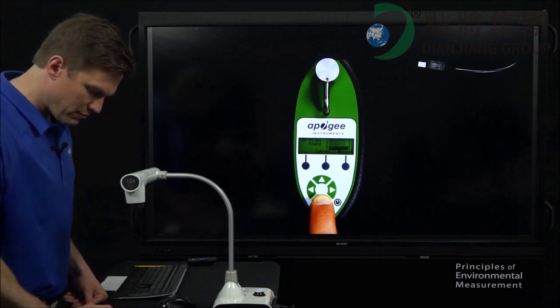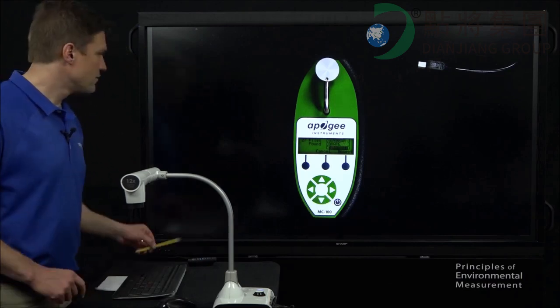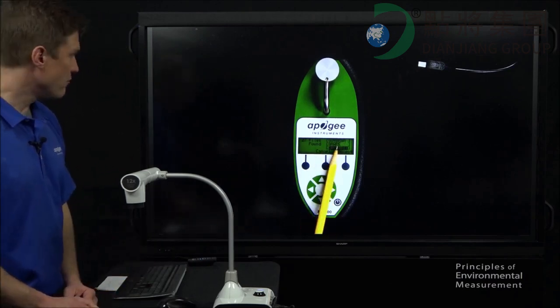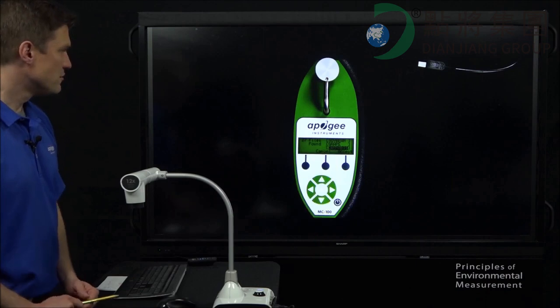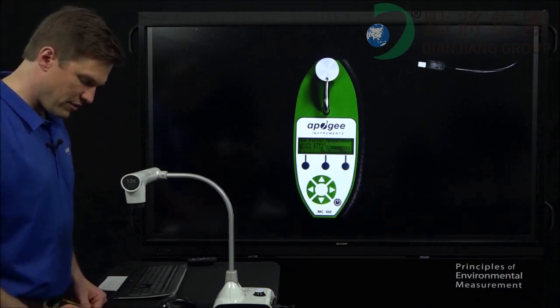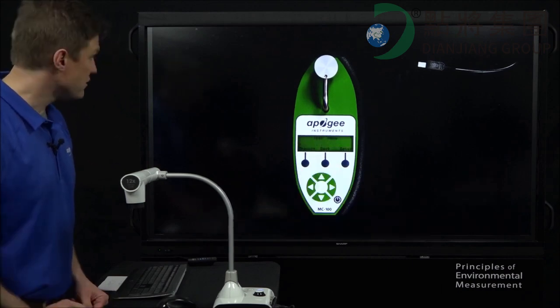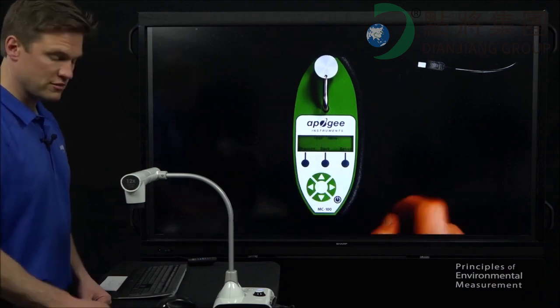It may be down at the bottom, or maybe it's in the middle of the list somewhere. There's cannabis, down at the bottom. So the last two here, we have grape and we have cannabis. So excellent. Let's hit accept. Now we have cannabis coefficients selected. We can exit out of this screen and we're ready to take measurements.